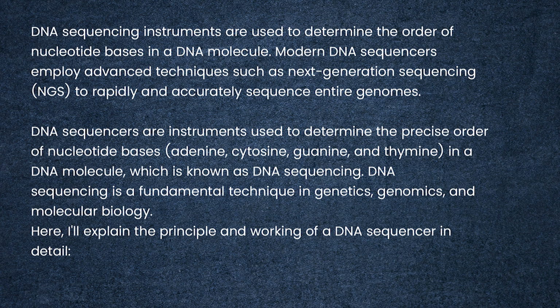DNA sequencers are the instruments used to determine the precise order of the nucleotide bases adenine, cytosine, guanine, thymine in a DNA molecule, which is known as DNA sequencing. DNA sequencing is a fundamental technique in genetics, genomics and molecular biology.